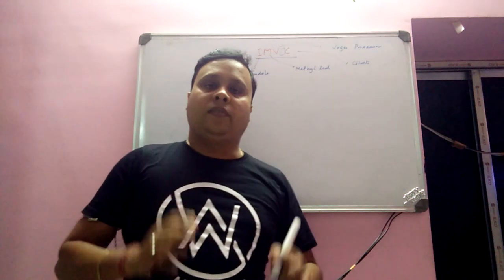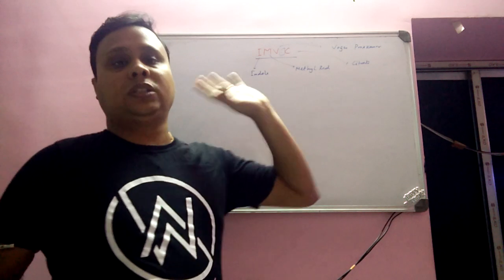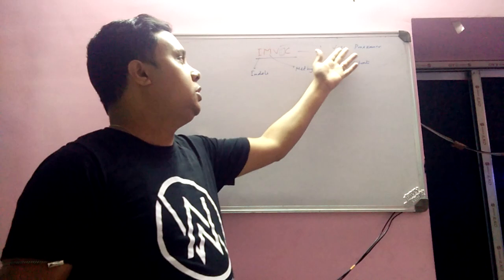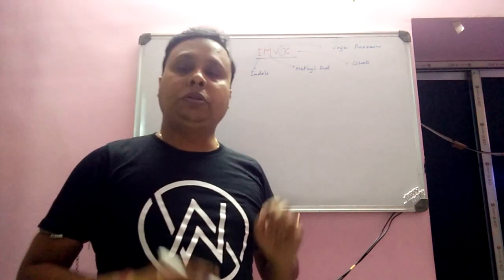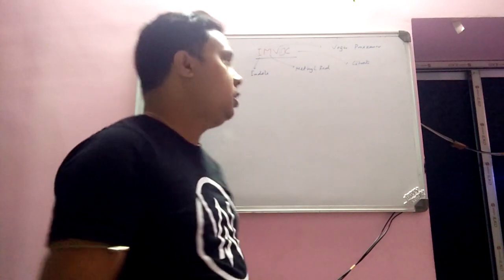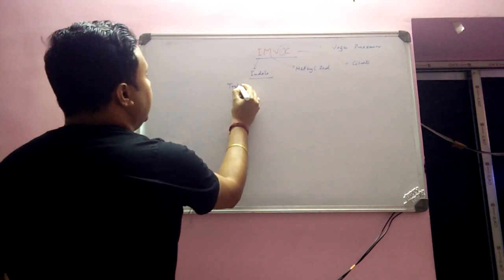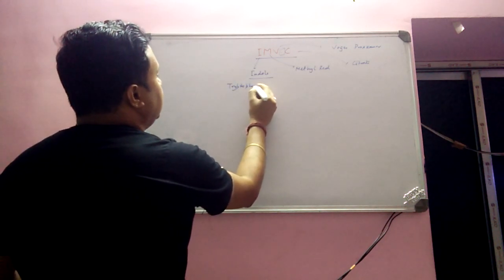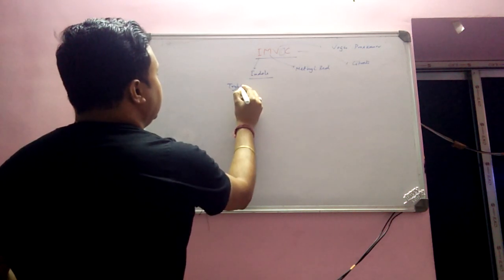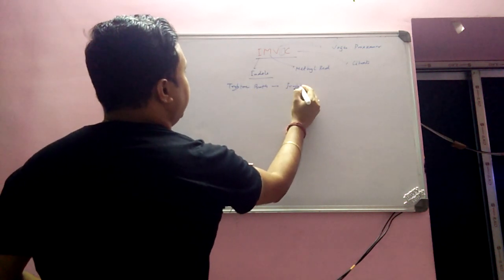Important thing to note is that fecal coliform like E. coli gives indole and methyl red positive tests, while non-fecal coliform like Klebsiella pneumoniae and Klebsiella aerogenes produce Voges-Proskauer and citrate as positive tests. So we need to understand first the basic idea of the indole test. In the indole test, we are using tryptone broth, which contains an amino acid called tryptophan.